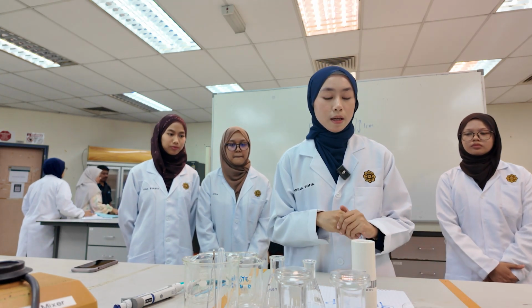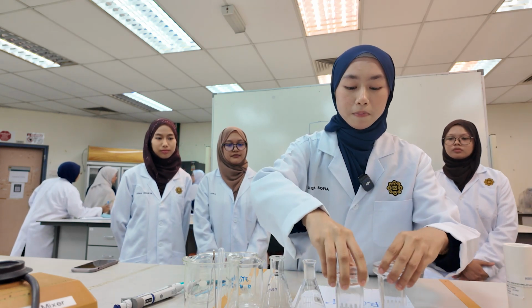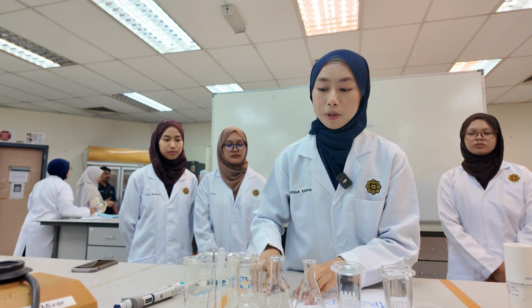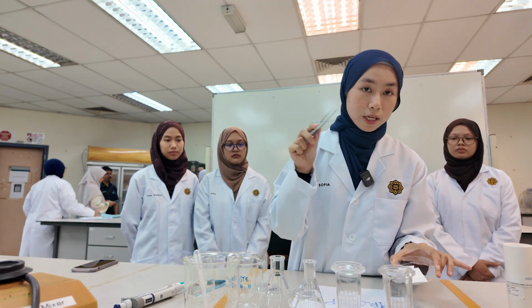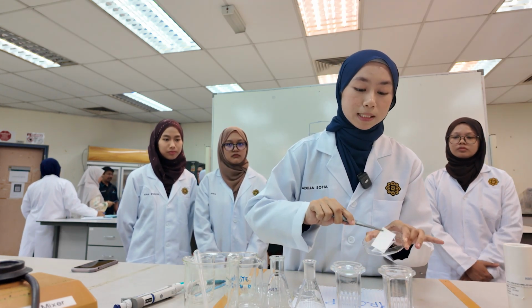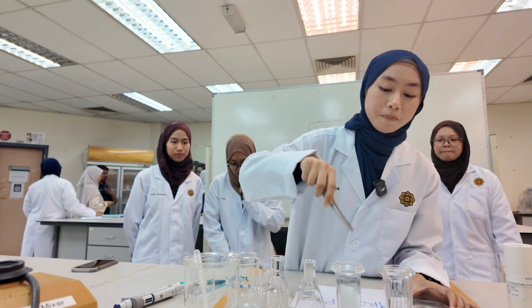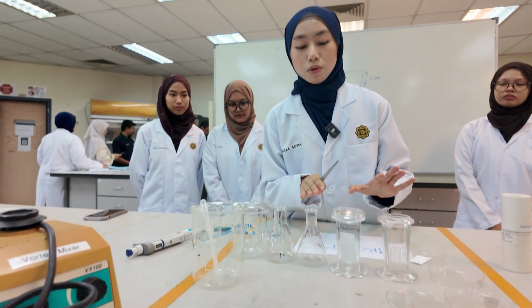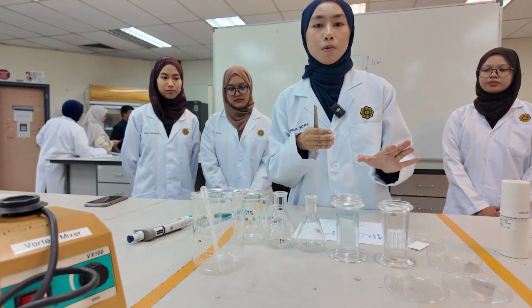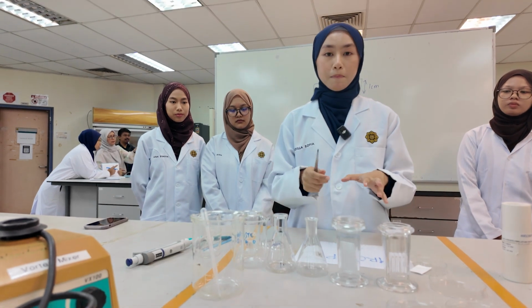Then we can put them into the developing chamber using forceps. Using forceps, gently place the TLC plates into the developing chamber. Then we let the solvent rise to within 1 centimeter from the top of the plate.